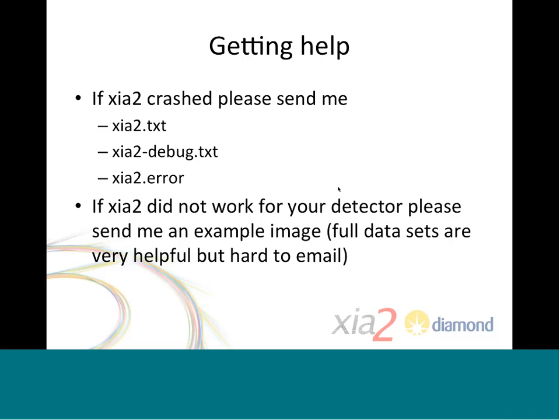But there are some caveats that apply to that, so if the images are uncorrected, it's generally much more difficult to support. But as I say, for the majority of things like ADSC, Rayonics, and Pilatus detectors, everything works fine.